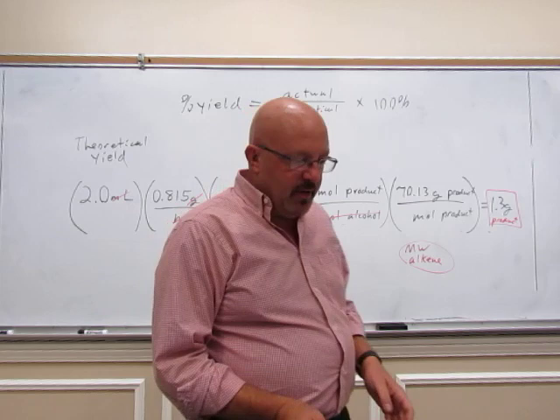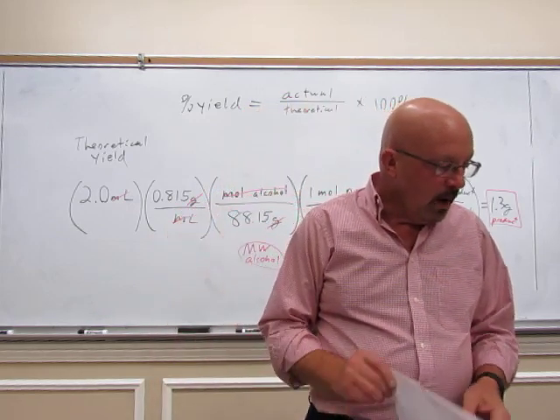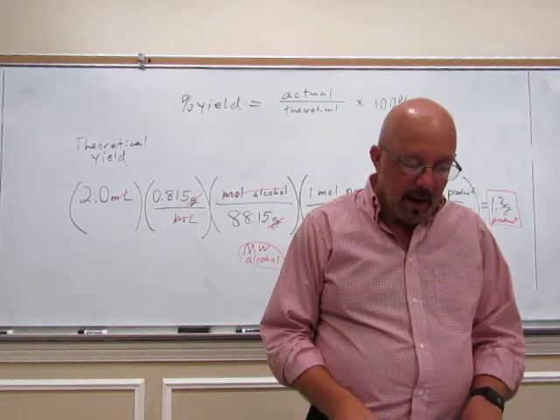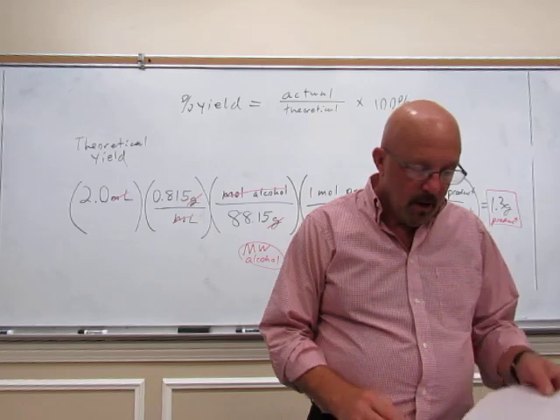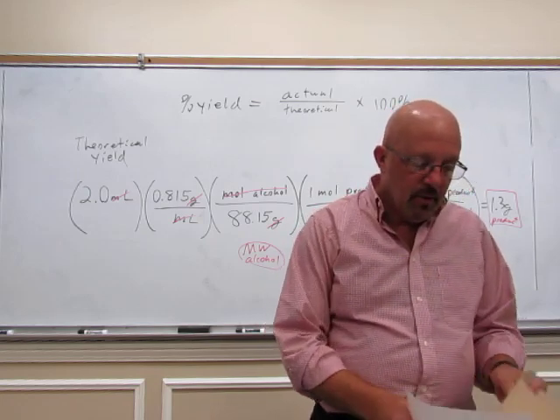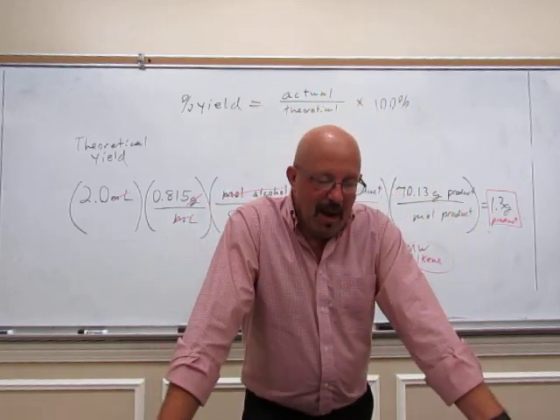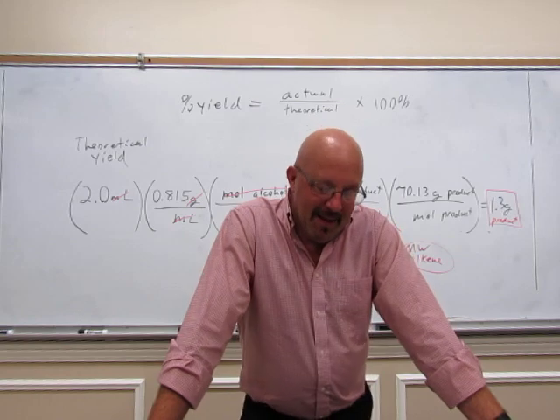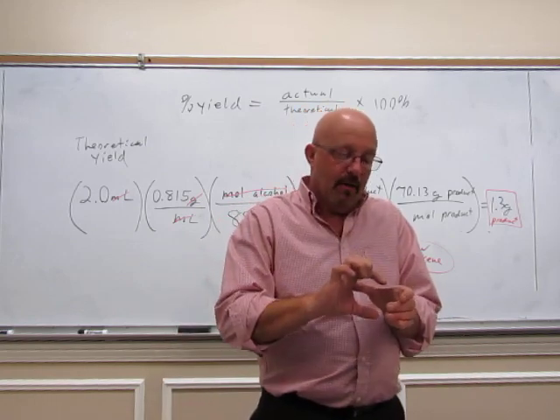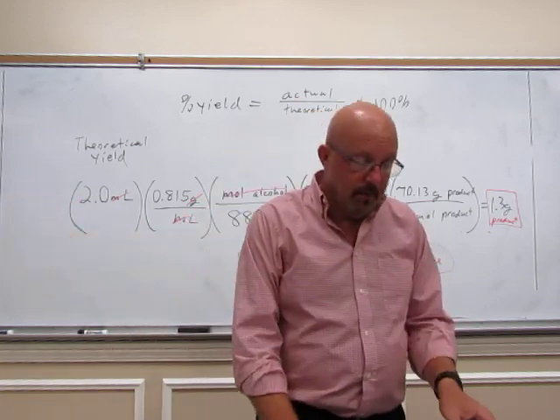Now, since the GC is not working, I want you to run some instrument. So we are going to take an IR spectra of your product. Now again, your product is extremely volatile. Please keep the cap on as much as possible and keep it in the ice as much as possible. So got a beaker of ice, you got your vial in the ice, take the whole beaker and everything with you down to the IR room.